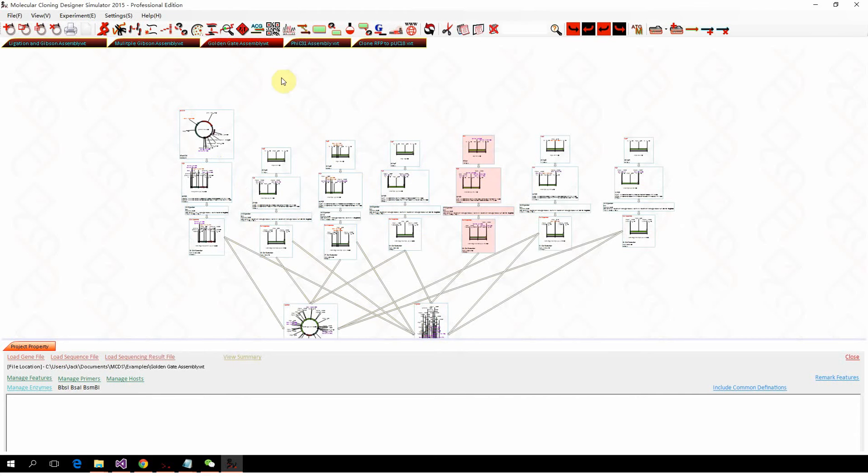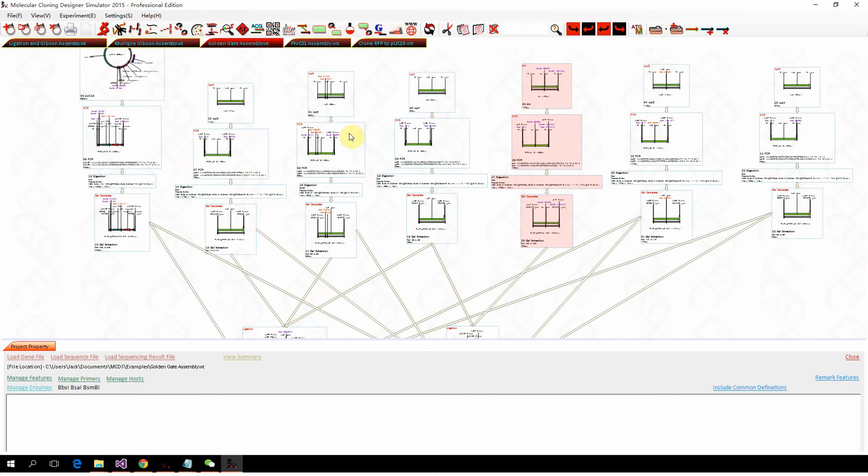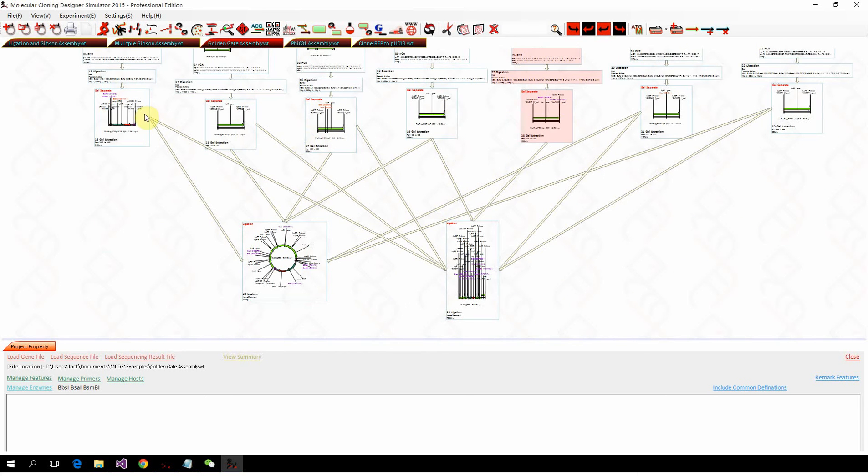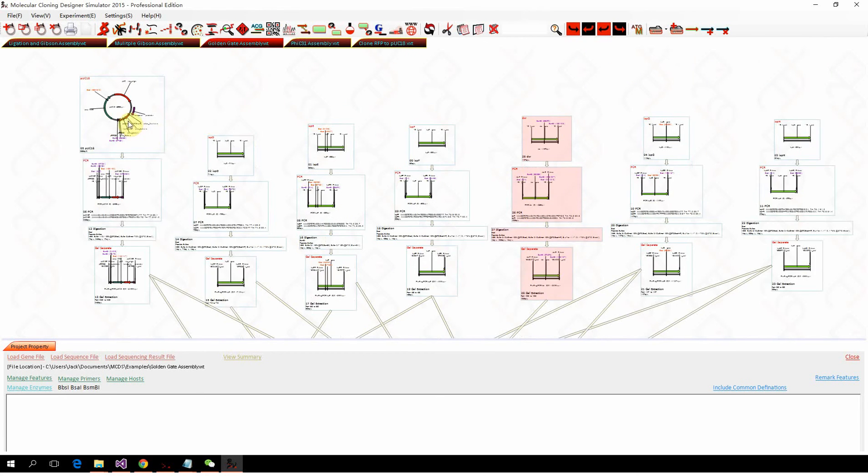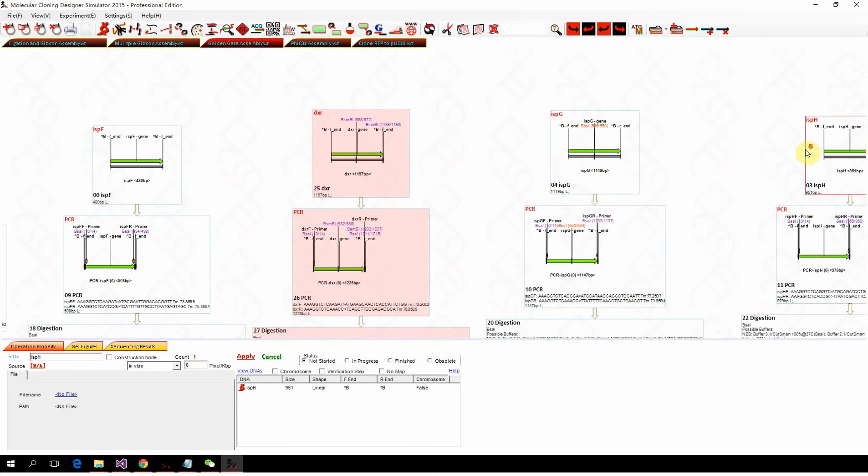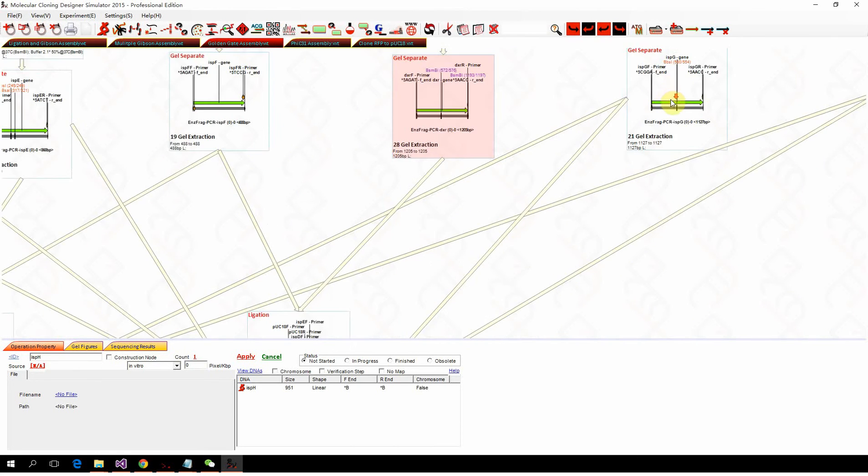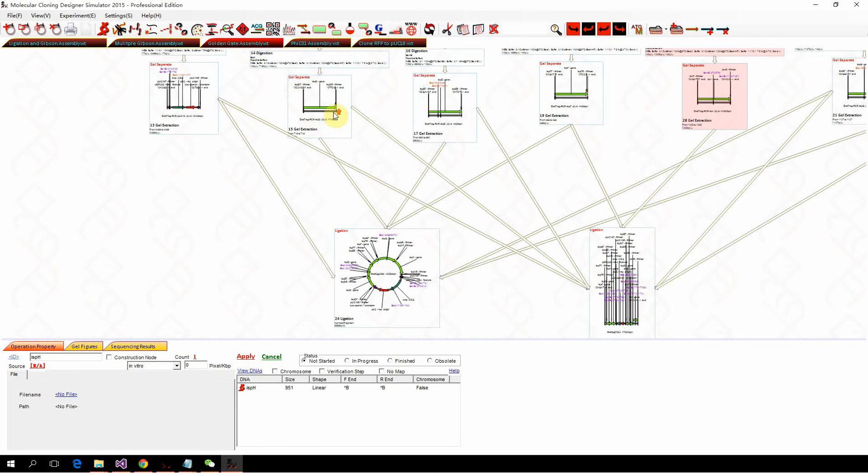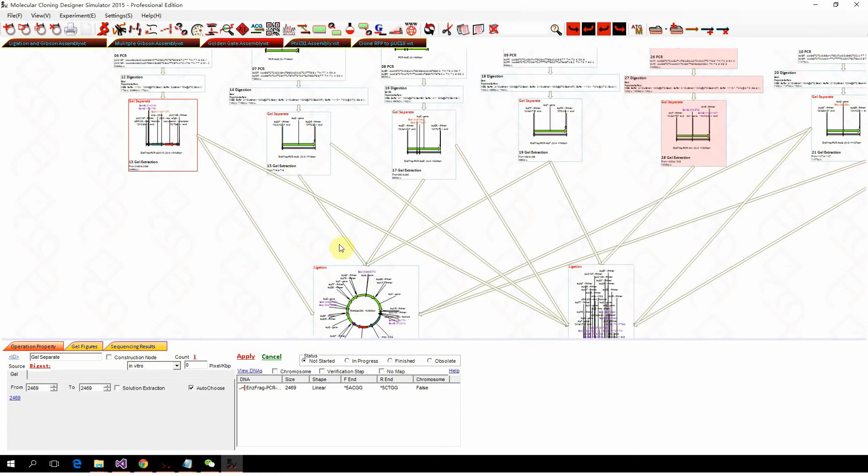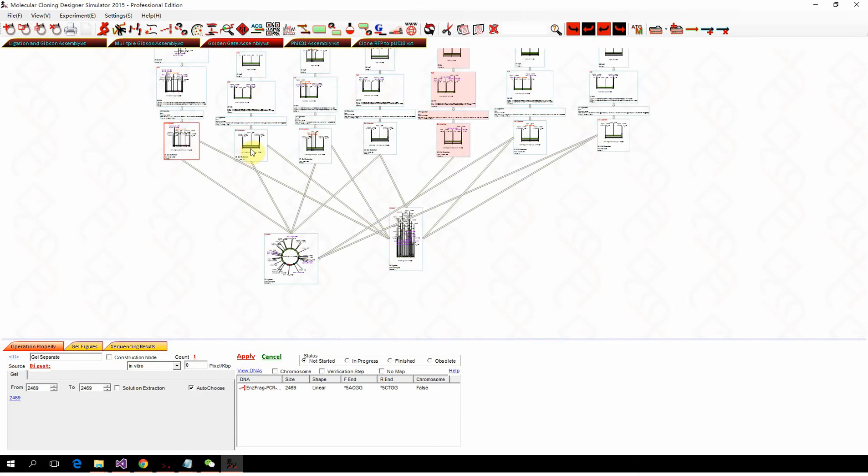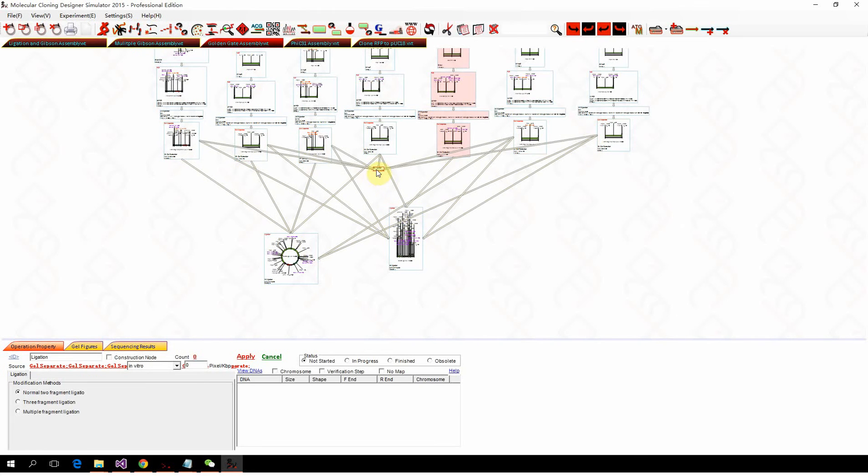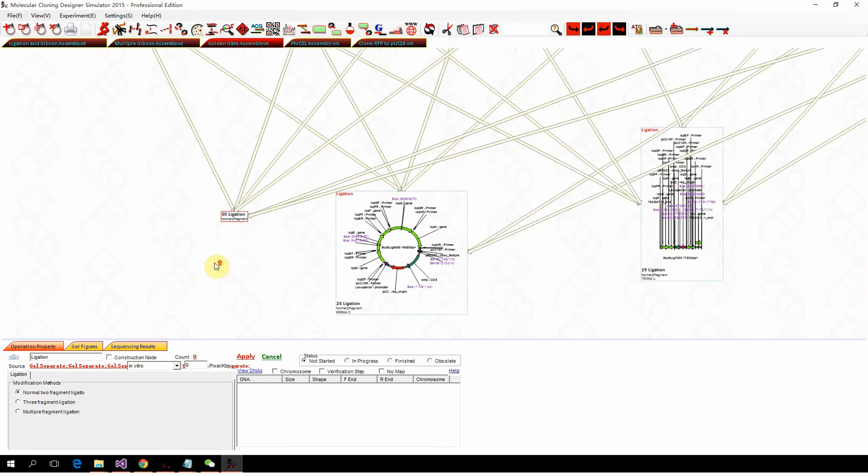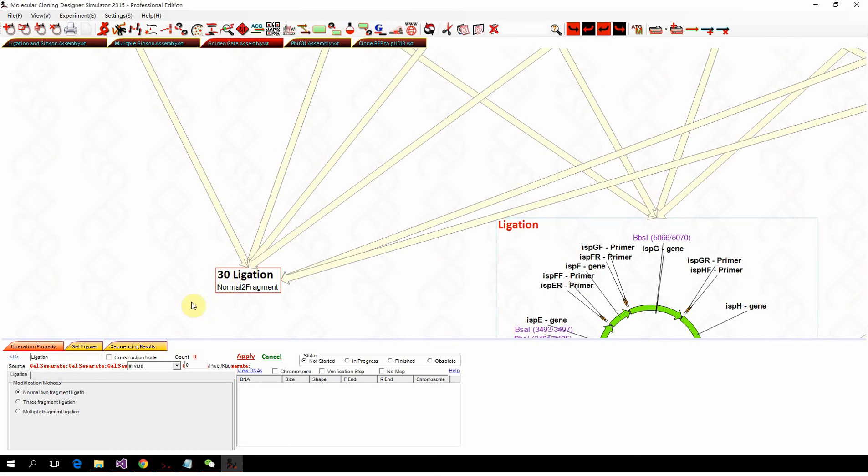Now we look at the Golden Gate assembly. In Golden Gate assembly, it's a multiple fragment ligation. We also have one, two, three, four, five, six, six fragments. They are all digested and designed with the proper ends. We just select all six, one, two, three, four, five, six, and do the ligation.